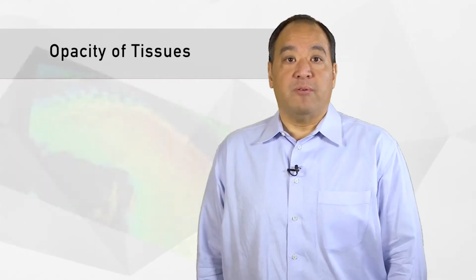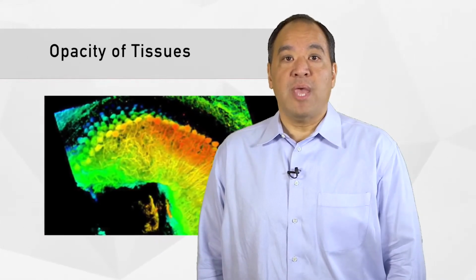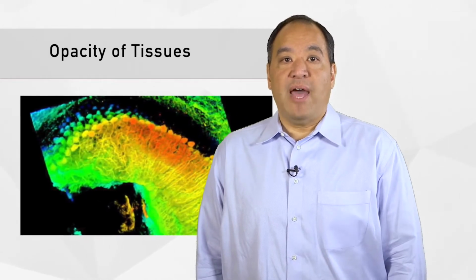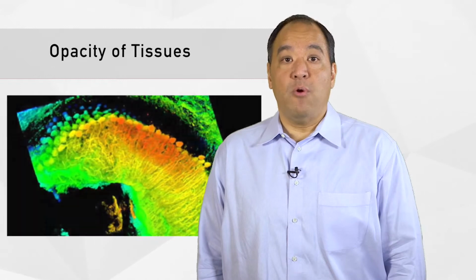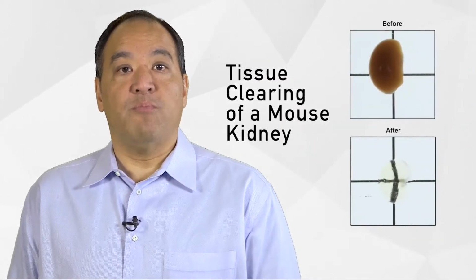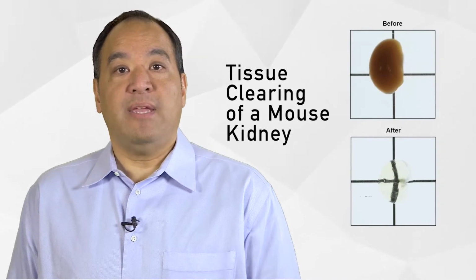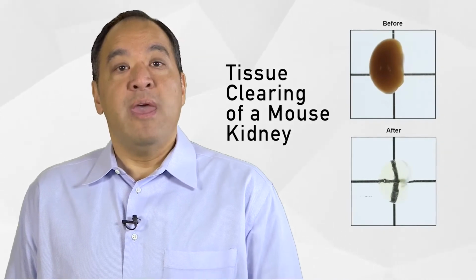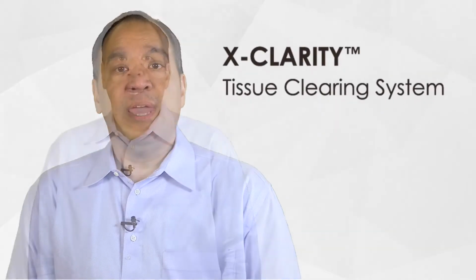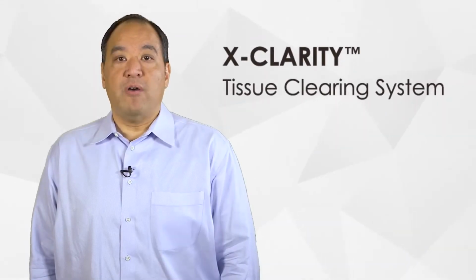One such obstacle, the inherent opacity of tissues, has proven particularly difficult to overcome. Ultimately, if light can't penetrate a tissue, there's no way to image it. Scientists have searched for a method to turn tissue more translucent while maintaining its structural integrity. With the invention of tissue clearing, and notably the CLARITY technique, it is now possible to achieve true volume imaging of intact tissue.